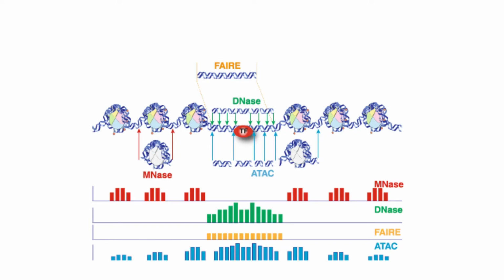Overall, MNase-Seq's ability to examine what chromatin is histone-bound and thus likely unavailable for transcription allows the researcher to get a glimpse into how these genes are regulated.